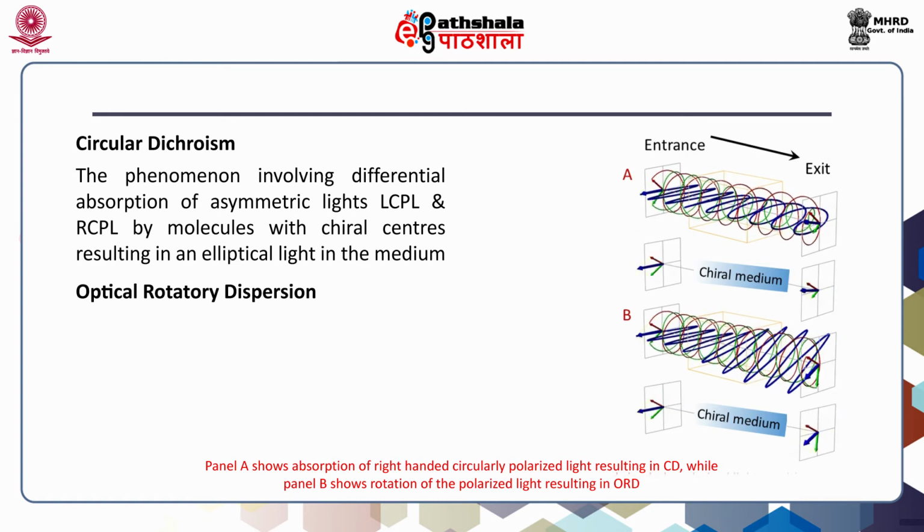You see that the component vectors are rotating in opposite directions, but the blue one is oscillating in only one direction, that is the horizontal. It indicates that if you add left circularly polarized light and right circularly polarized light, they will provide you a linearly polarized light.